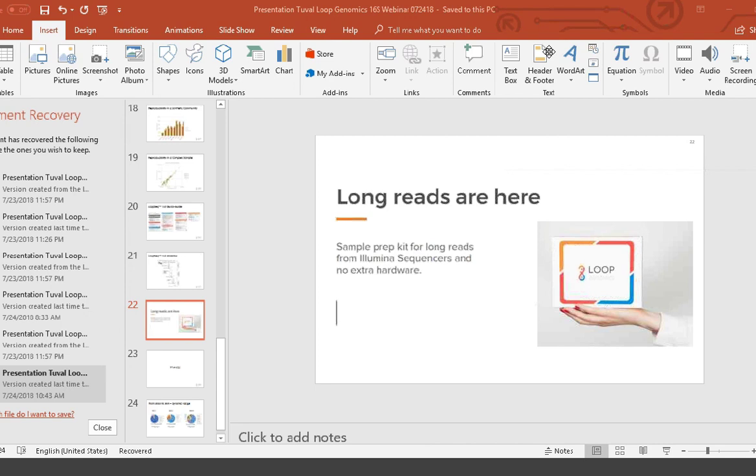Moving on to the next question. How many reads per sample do you recommend, let's say, for a human gut metagenomic sample? Yeah, that's a great question, and there's no one answer to it because different people have different applications. Even for a gut microbiome, there may be variation in how deeply people want to look into a sample. But just based on what our customers in the gut microbiome space are looking at, they generally want to look at anywhere between 5 and 30,000 unique long molecules.